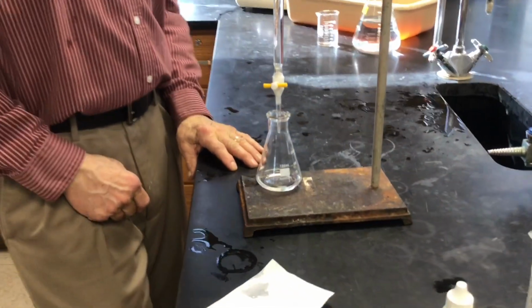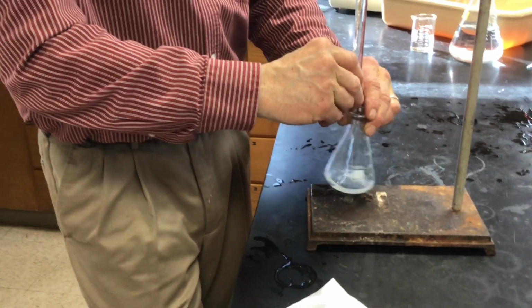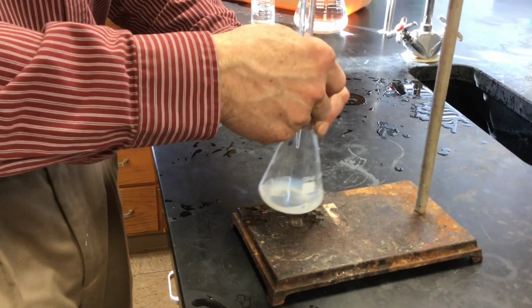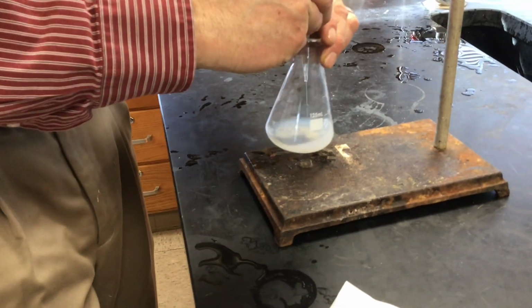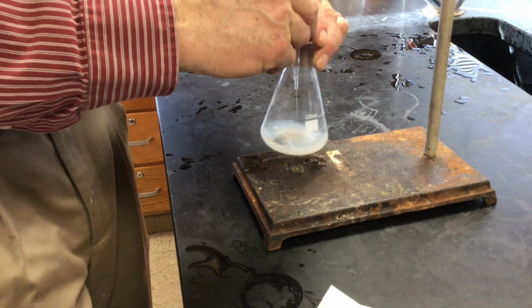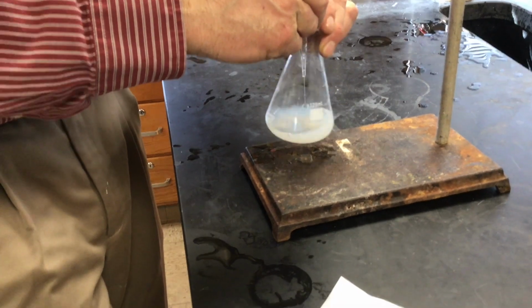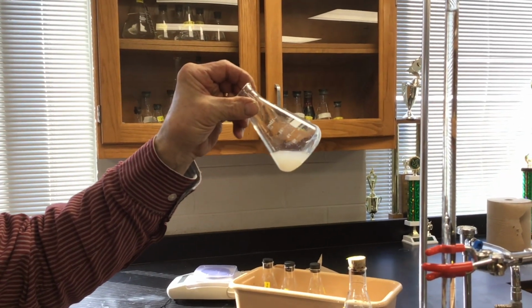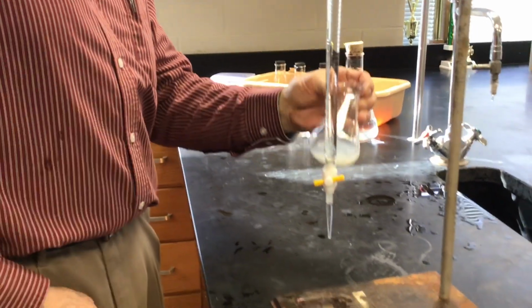Here we go. We've done a trial of this already, so we have an idea of how much it's going to take, so we can go fast in the beginning. You see how it's looking milky white right now. That's the AgSCN precipitate. But when the silver's gone, it's going to start to look off-white because we'll start to mix some red in with it. I think that was it. Now it's gotten clumpy looking. I was thinking it was kind of going brown.